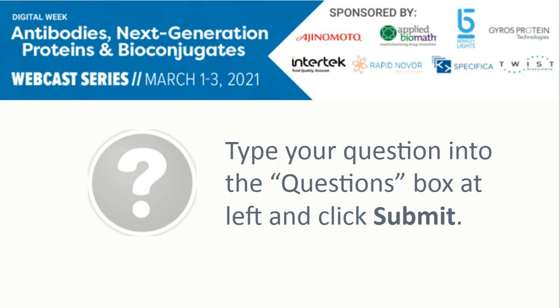Okay, great. Next question. How to ensure the H and L chains from PAB sequencing are naturally paired? Yeah, great question. Of course, the pairing of the antibody heavy and light chains is a problem. I've seen other people do this kind of approach that we've outlined here, in which they're expressing heavy and light chains and then doing a combinatorial matrix and trying to find the best binders that way. That's not what we're doing.